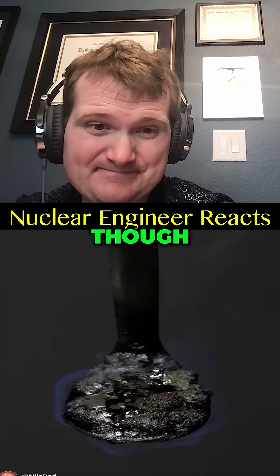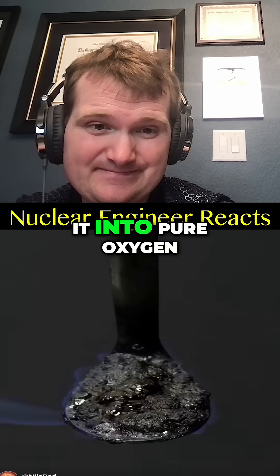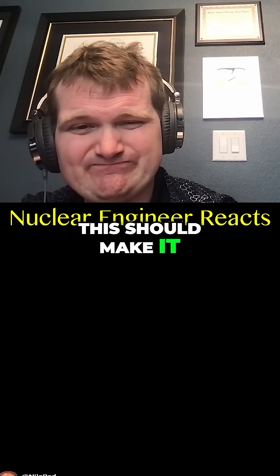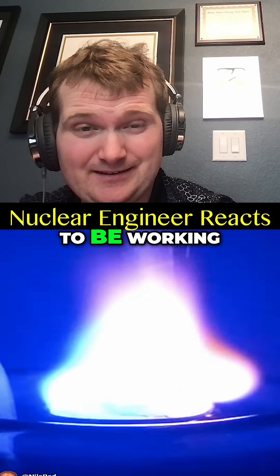Still isn't very bright, though, and what I've been really wanting to do is to try lowering it into pure oxygen. In theory, this should make it burn a lot better, and it definitely seems to be working.